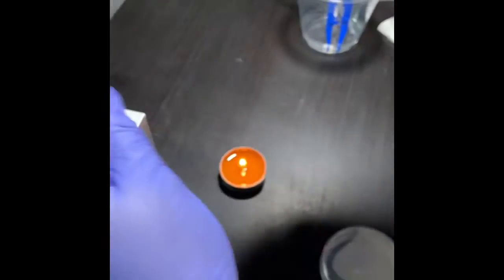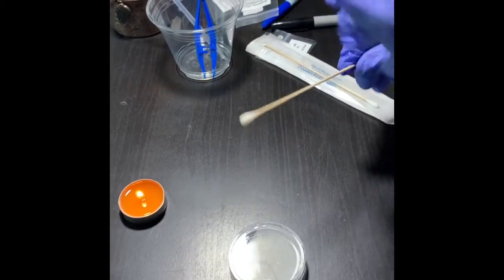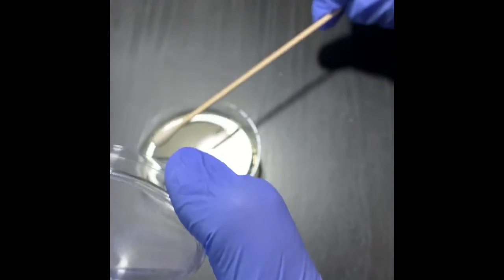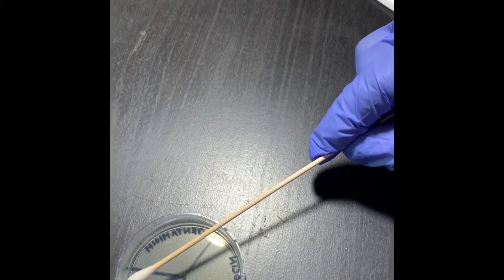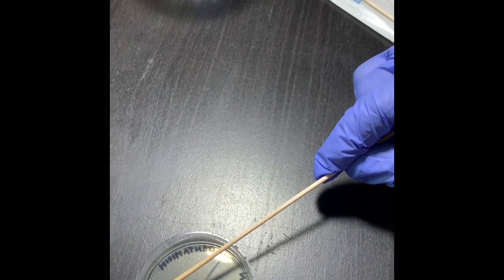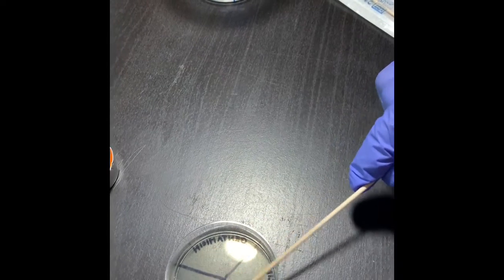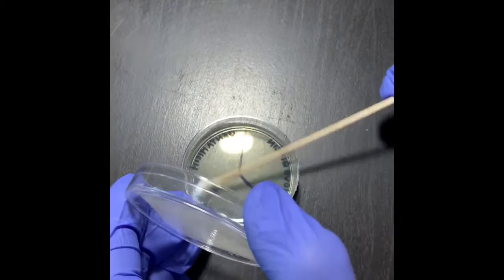Now with this cotton swab, look at it carefully. I am going to streak the plate, but it is not streaking, it is called making a bacterial lawn. I'm going to paint the agar plate all over with my cotton swab.